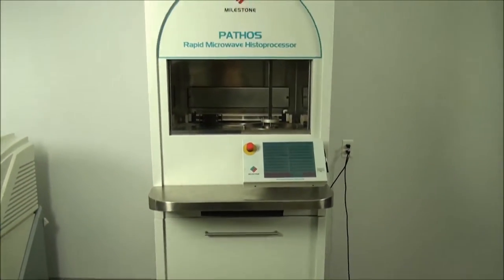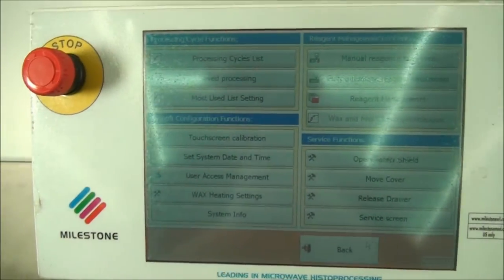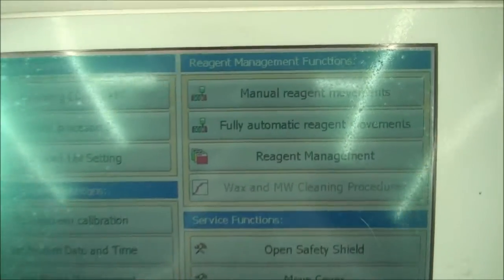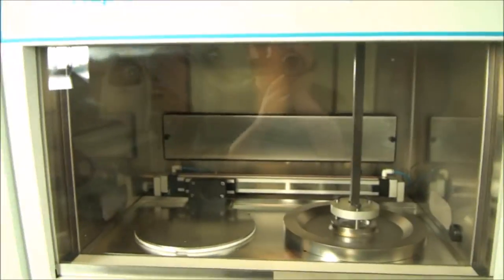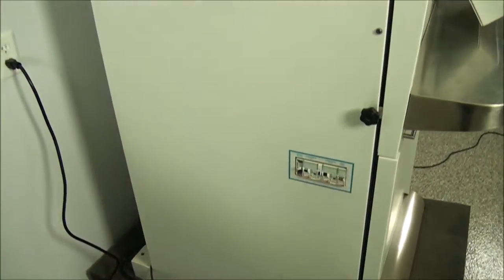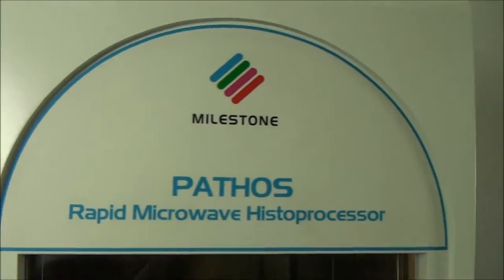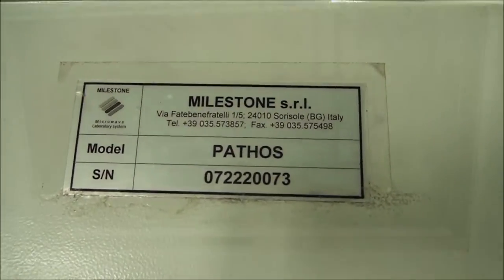Hello and welcome to New Life Scientific. My name is Kyle and today I will be showing you the Milestone Pathos Rapid Microwave Histoprocessor. In this video, I will go through some of the various functions of the Pathos, including raising and lowering the safety shield, moving the cover between the microwave cavity and the wax cavity, transferring reagents from the front tanks to the back tanks, performing a power test, viewing and creating new processes, and viewing and changing wax heating settings. All of these functions are completed using a high-precision touchscreen interface that can be used either by hand or with the provided stylus.